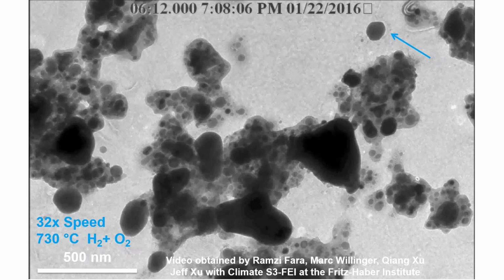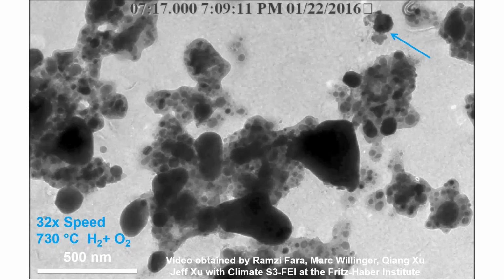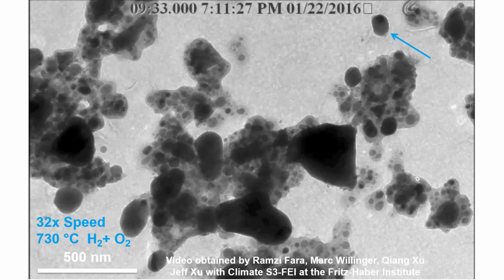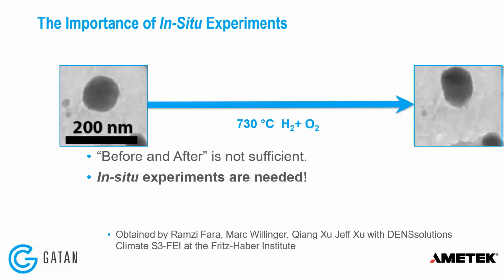And the thing that I like to point out from this video, besides the beautiful video that it is, is the importance of doing these sorts of in-situ experiments. Because if you looked at this sample before you applied this stimulus and then after, you might see something like this. And there might be a change in the sample after the in-situ stimulus.